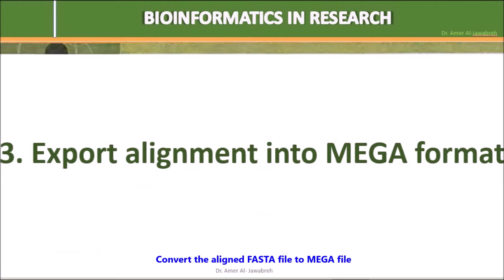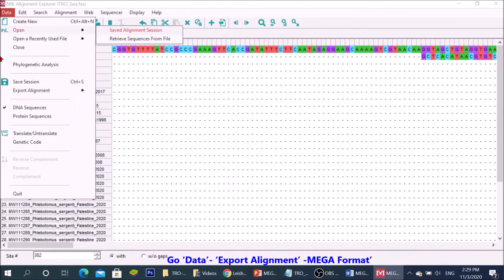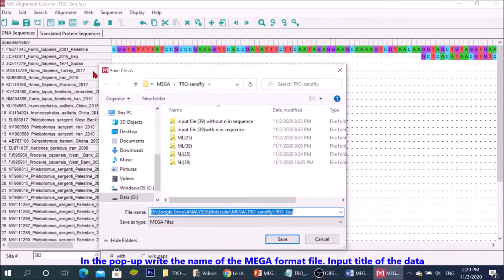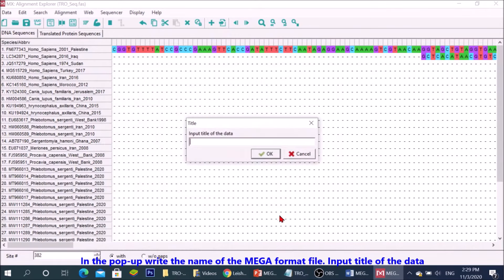Convert the aligned FASTA file to mega file. Go data, export alignment, MEGA format. In the popup, write the name of the MEGA format file. Input title of the data.